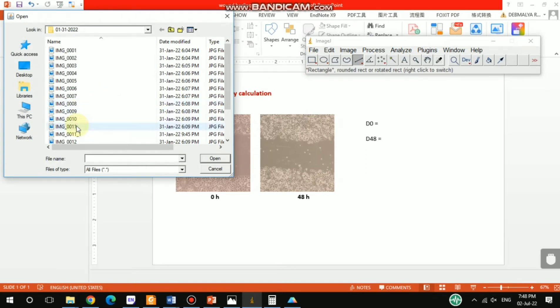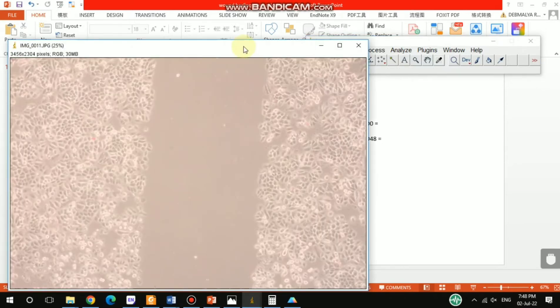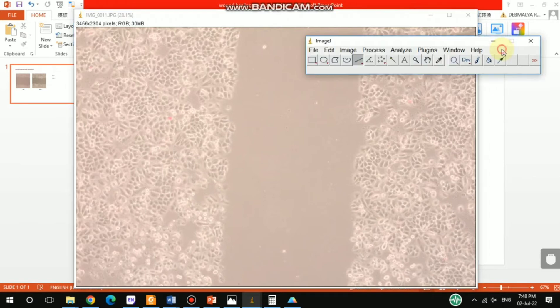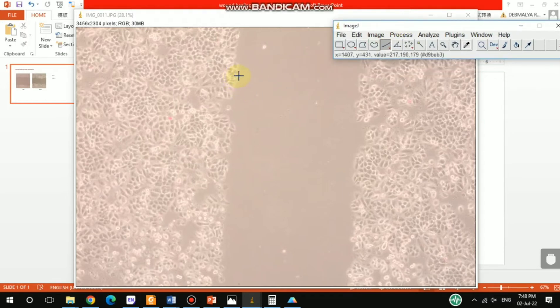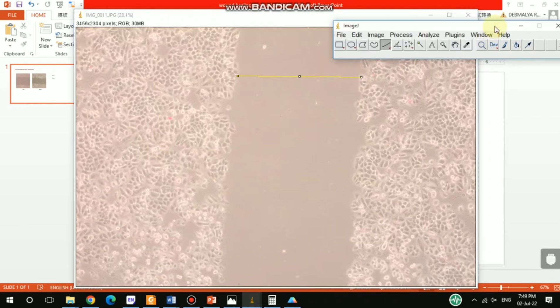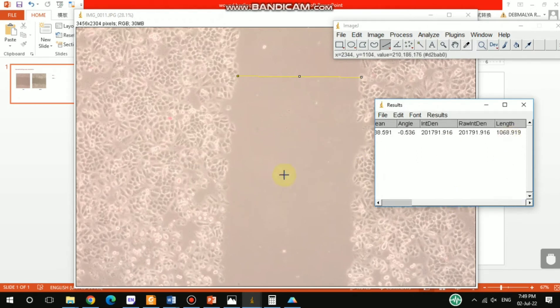First, we have to open the ImageJ software and then open your desired image file. I'll do the zero hours image first. You have to click this measuring tool, then select three different locations to measure the distance. Go to Analyze and Measure — we get the first value of 1068.